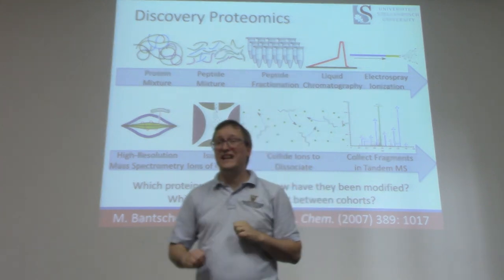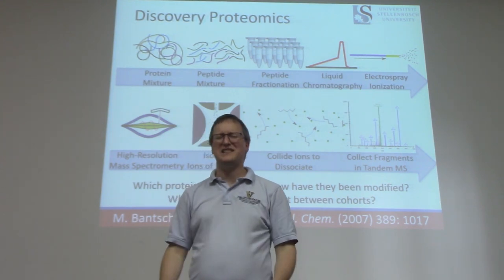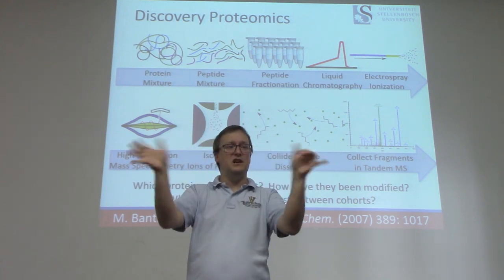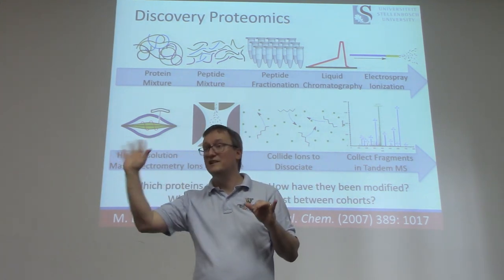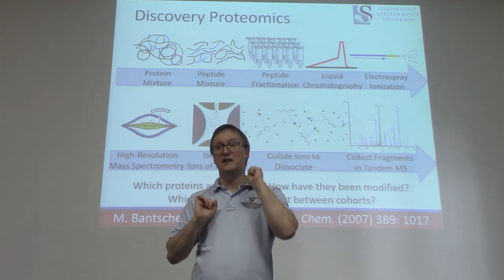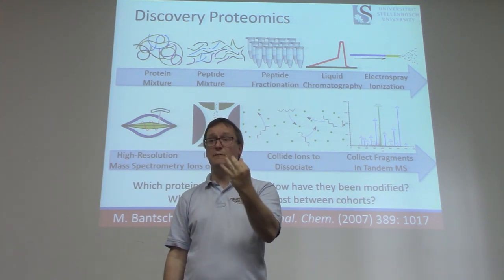We then use a process called collision-induced dissociation, or CID. This is a process that a lot of people say just rips apart peptide bonds. That's a really, really bad explanation of what it does. But the short version is that we have this peptide that has some number of amino acids, and the process, in effect, will cause an individual peptide bond within these peptides to snap. And that gives us an ion that represents the left side, the N-terminal side of the peptide, and another ion that represents the C-terminal side of the peptide. That's our starting information. The list of fragments produced by an exploding peptide, that's a really terrible definition, but we'll just go with it for the moment. The list of fragments produced by an exploding peptide are what we're starting from in a tandem mass spectrum.